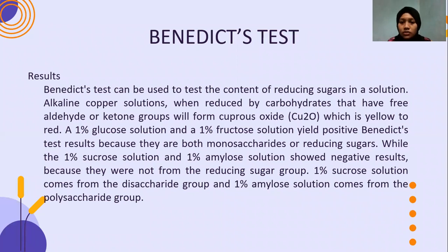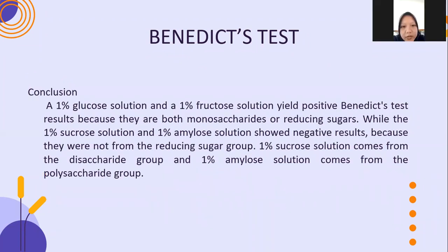A 1% sucrose solution comes from the disaccharide group and a 1% amylose solution comes from the polysaccharide group. Next. And the next is conclusion.